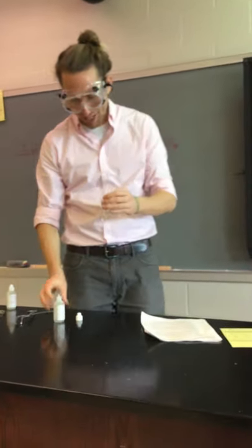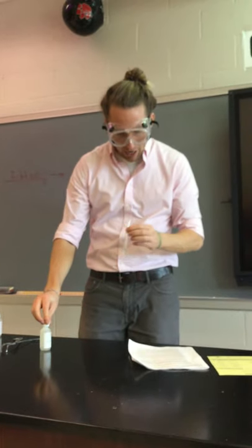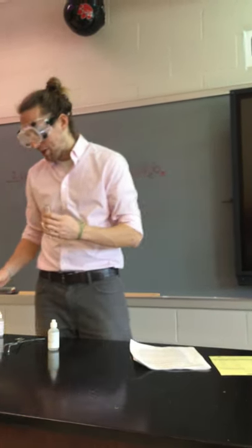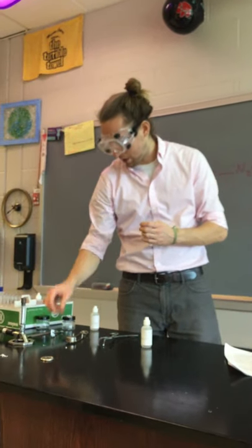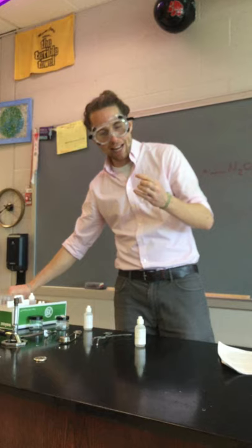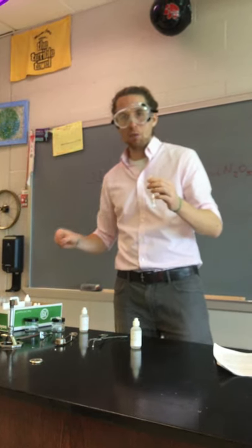All right, I'm back. While we have the drops in, we also have our lights back. This has about 40 drops of hydrochloric acid. I'm going to take, again, a piece of magnesium, very similar to the stuff that we just saw react with the oxygen in the air around us. We're going to put that into our hydrochloric acid and we'll see what happens.